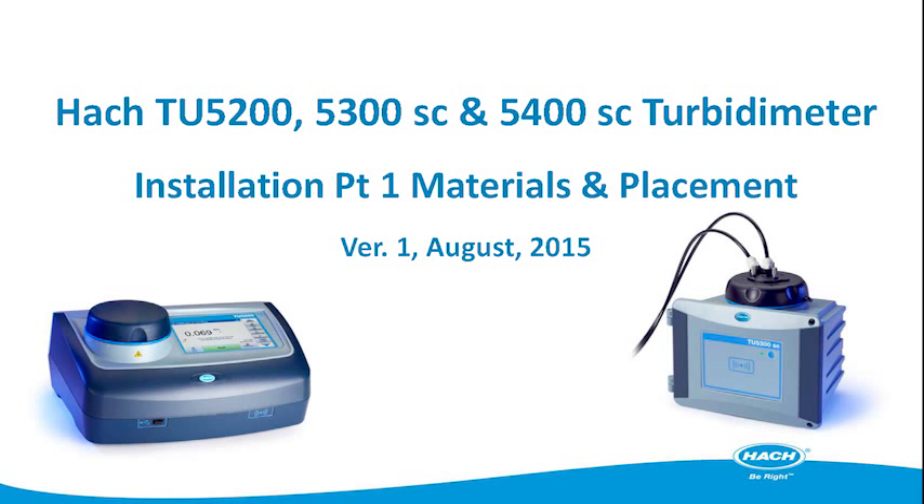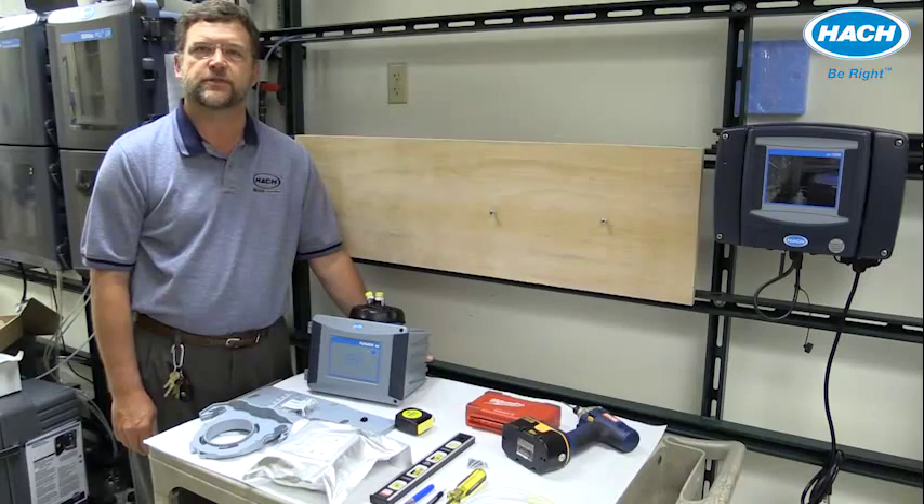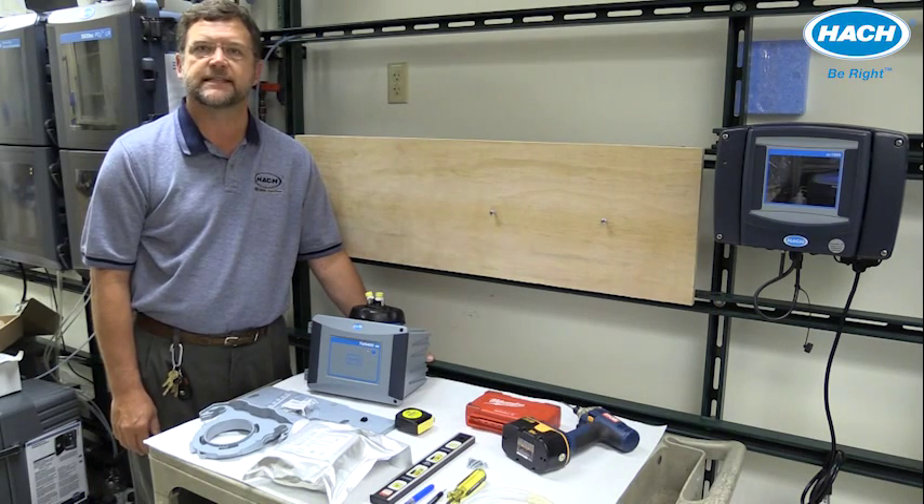Hi, I'm John Parsons with the Hock Technical Training Center. This video will demonstrate installation of the TU5200 lab turbine meter and the TU5300 and TU5400 SC process turbine meters.